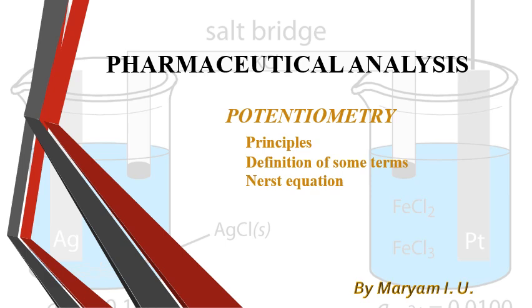Welcome everyone to today's lecture on potentiometry, a key technique in pharmaceutical analysis. This method allows us to determine the concentration of a solute in a solution by measuring the potential difference between two electrodes. I'll be guiding you through the principles, equipment, and applications.